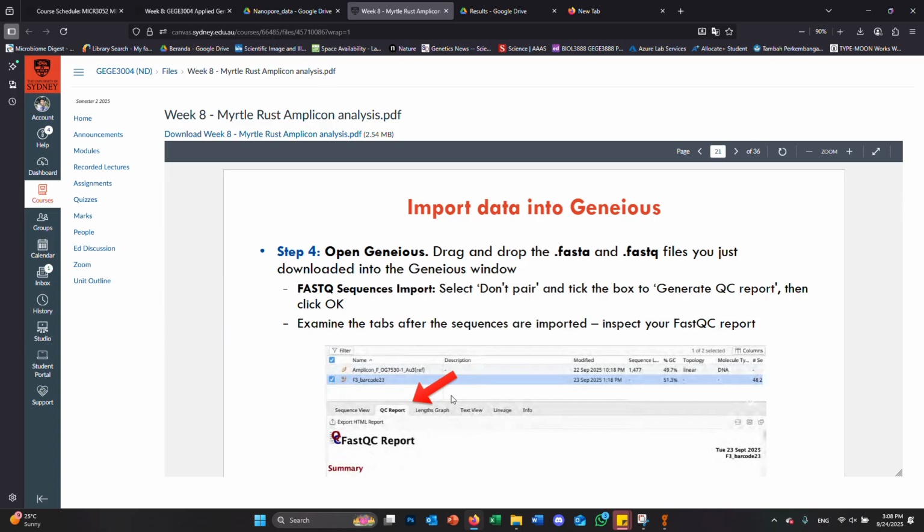And so you've got your, pull up the two files here. You've got your original sequence and you've got your barcode assembled. You want to align them to each other to see how they match. So we can use the Muscle alignment. Muscle is just a different type of alignment software. I like Muscle, it's nice and fast. The Geneious alignment I think is kind of slow? Yeah, Muscle is a bit faster. So we just use Muscle, it's perfectly fine.